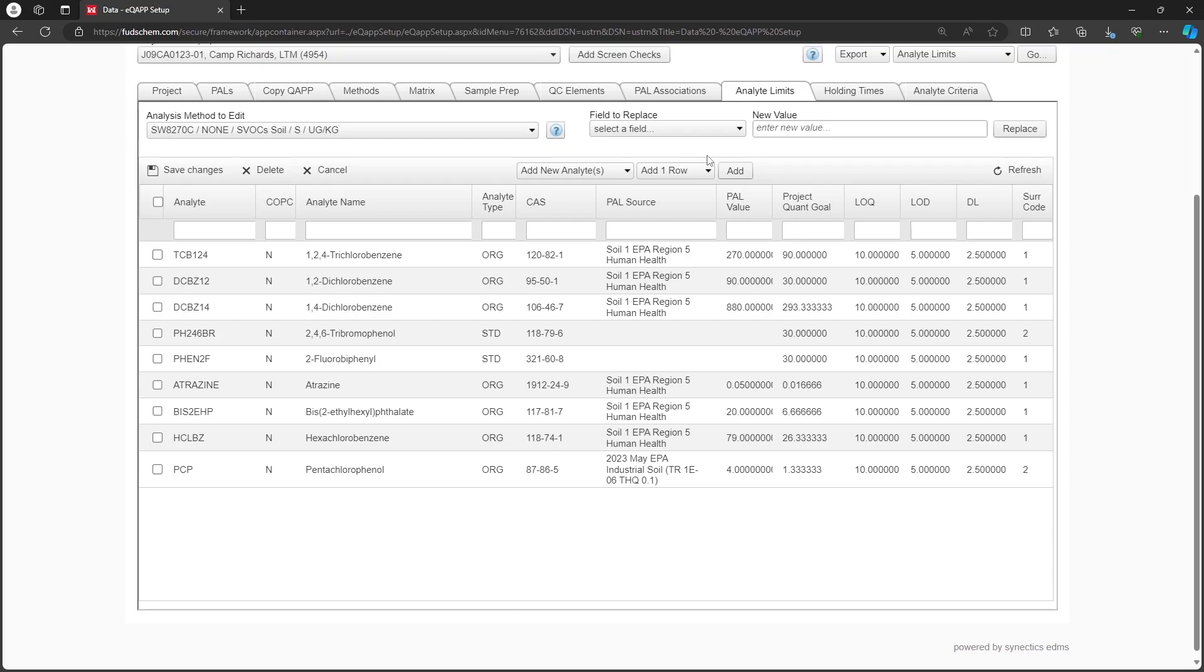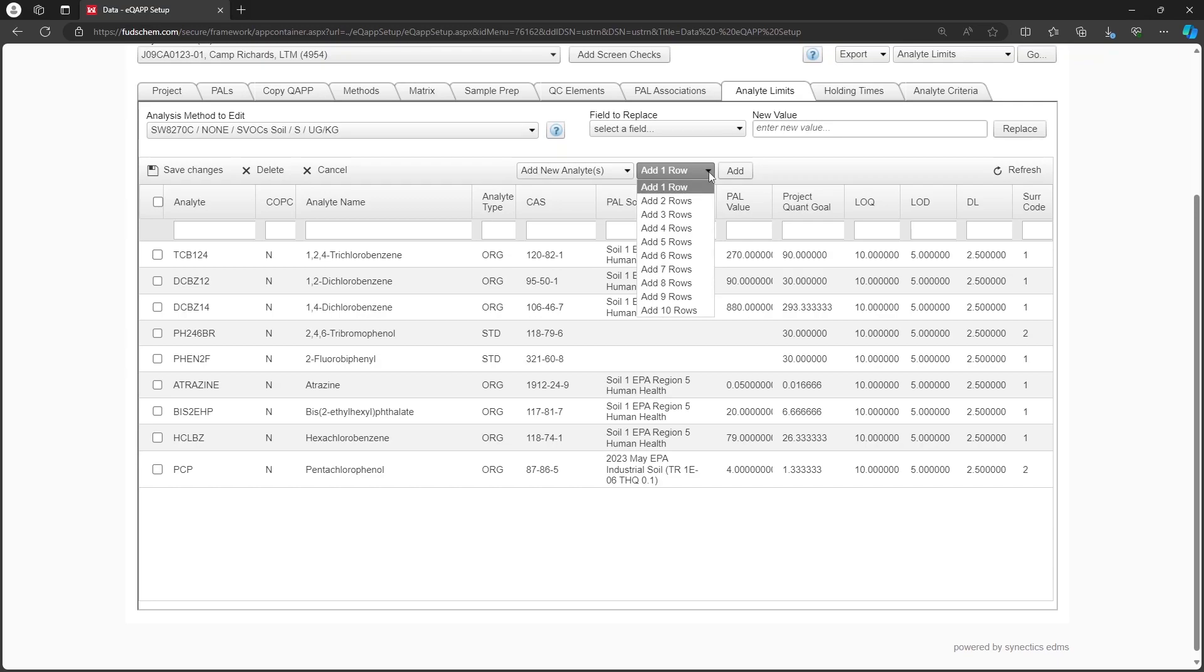Next, let's add new analytes and surrogates. To add analytes, make sure the drop-down towards the top is set to Add New Analytes, then choose the number of analytes to add. For this example, we will choose 5.